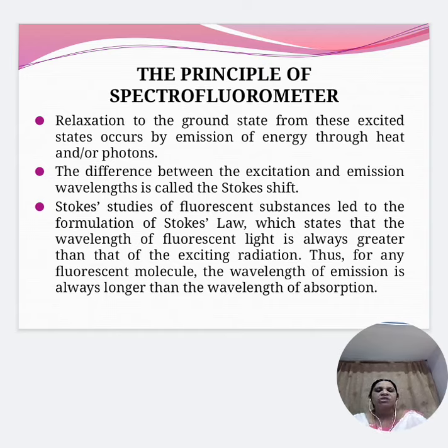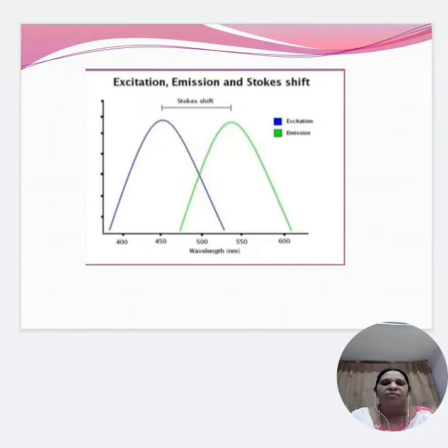That's why it's called Stokes' law, which states that the wavelength of the fluorescent light is always greater than that of the excitation radiation. Thus, for any fluorescent molecule, the wavelength of emission is always longer than the wavelength of absorption.